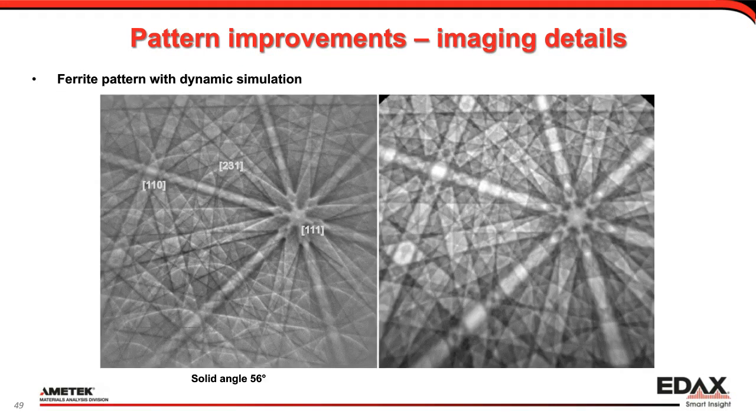And just go back, there is the detail. There you have the original pattern. Next to it, the dynamic simulation. The image processing of the simulation is not exactly the same, but you can clearly recognize a lot of the details that we also see in the live pattern. And in some cases, it seems that in the live pattern, we see some more details even than what we can see in the simulation.